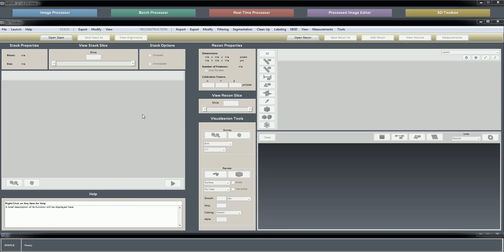And then export those aligned images to make your segmentation recipe to then run through the rest of the steps for the 3D reconstruction. And again, the details of all of that will be covered in later tutorials.